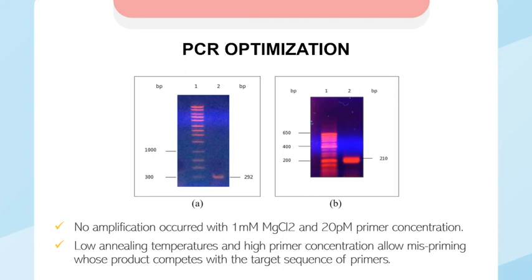The concentration of Taq polymerase was also very important. If its concentration is very high, non-specific background products may accumulate, and insufficient desired product may be obtained if it is in low amount.